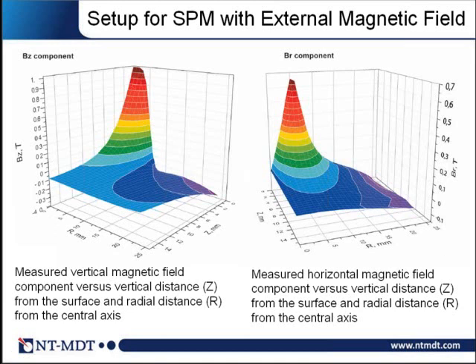homogeneous. And it's also rather easy to change this magnetic field, either by mechanical motion of some parts of the magnet, or, if that is too complex for some measurements, by just changing the position of the sample. As shown here, by changing the altitude of the sample with respect to the magnet, which you can do using different non-magnetic spacers, you can easily change the magnetic field from 1 Tesla down.